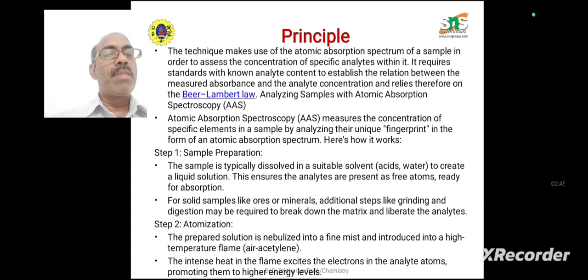For solid samples like ores or minerals, additional steps like grinding and digestion with concentrated acids may be required to break down the matrix and liberate the analytes. So for most sample preparation, we can use acids with the help of deionized water to digest the samples.